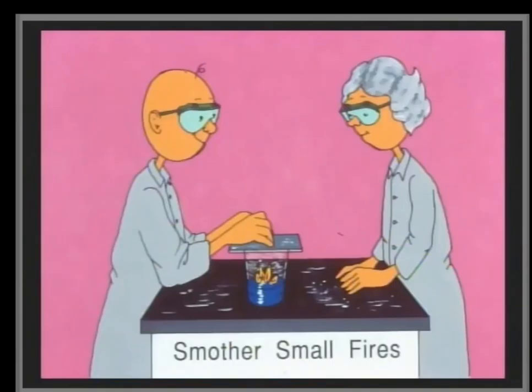A small fire in a beaker or other small container can be extinguished by covering the beaker with a glass plate or some other piece of glass from your drawer. As soon as the air supply is cut off, the fire will go out. This rule works at home too. If you have a grease fire in a pan, put a lid on it. Avoid fire by keeping flammable materials away from open flames.